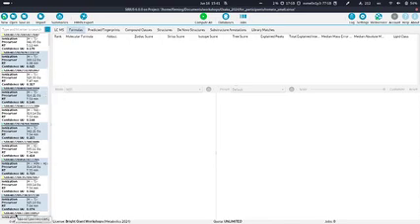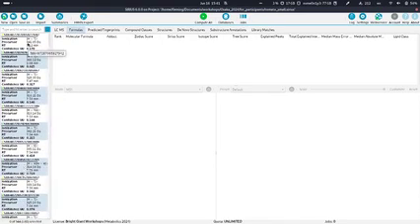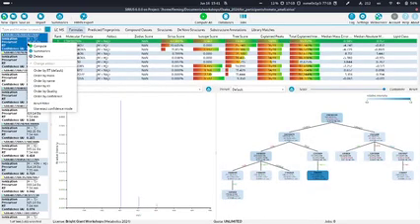Now we have only 144 compounds in this view, so at least quite a bit smaller. And what I also want to show you, again, by default this is ordered by retention time, but if we don't have much time, or if we are only interested in the most confident predictions, we can also order this by confidence, which we are going to do now.